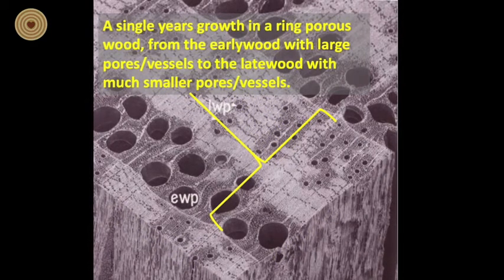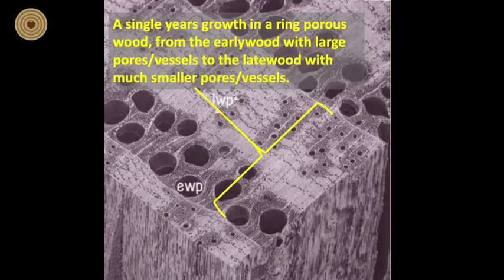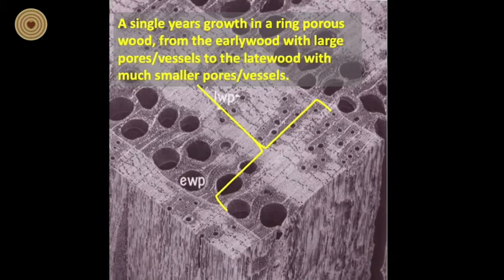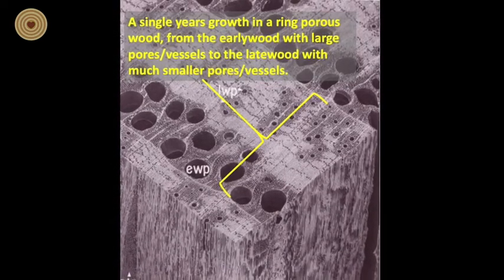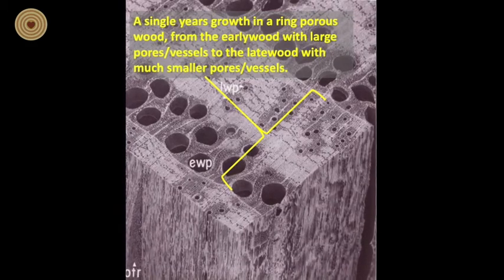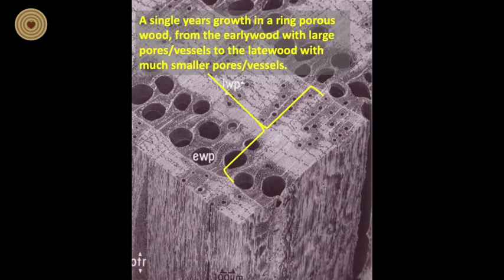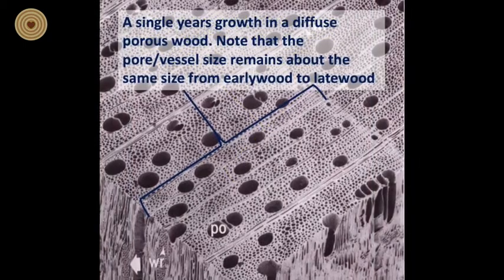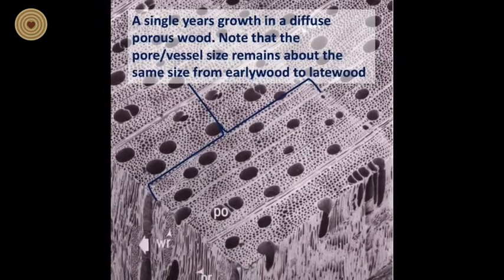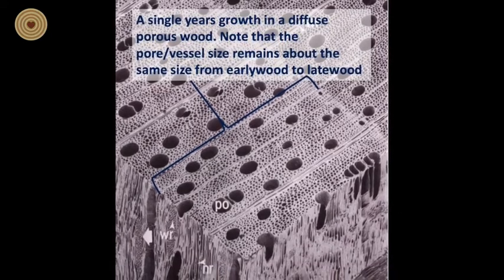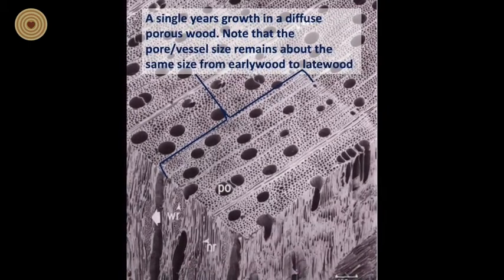In some hardwoods, the diameter of the vessels will change depending on the time a particular vessel is produced during the growth season. Some hardwood trees in temperate climates have larger vessel diameters in the early part or spring of the year, and the vessel diameter becomes smaller in the summer or early autumn. These species produce what is known as ring porous wood, which is the type of hardwood that we have been viewing so far. Some hardwood species, though, do not change their vessel diameter during the growth season, and these species produce what is known as diffuse porous wood. It can be more difficult sometimes to actually see growth rings in some diffuse porous species because there is a less visible delineation of each year's growth.